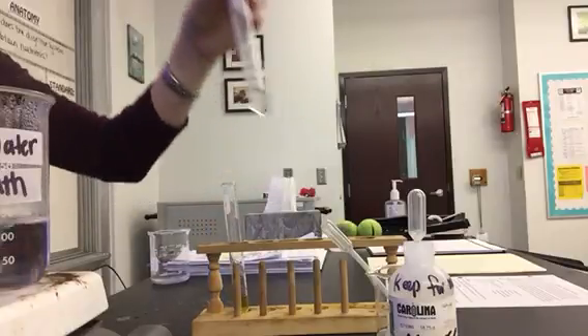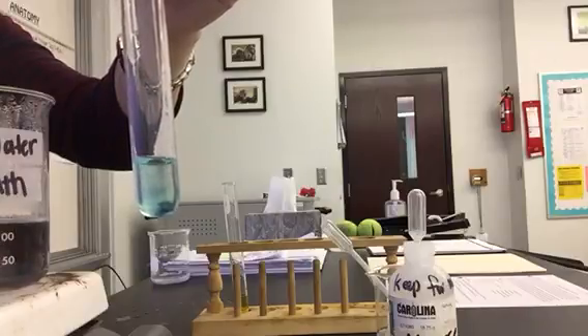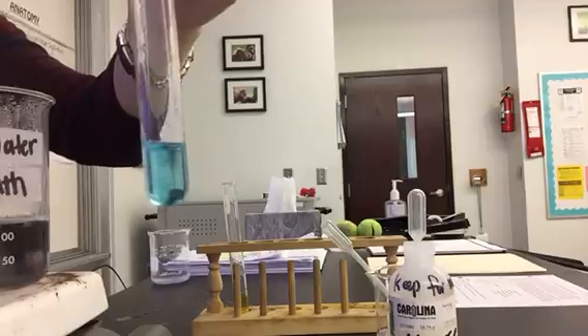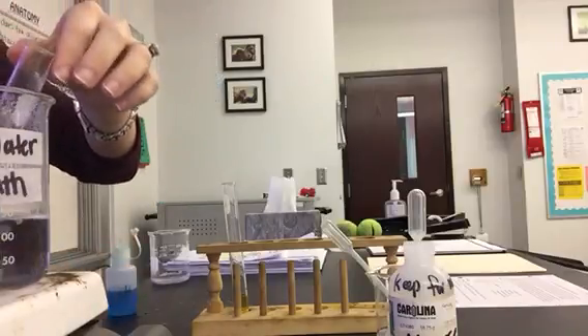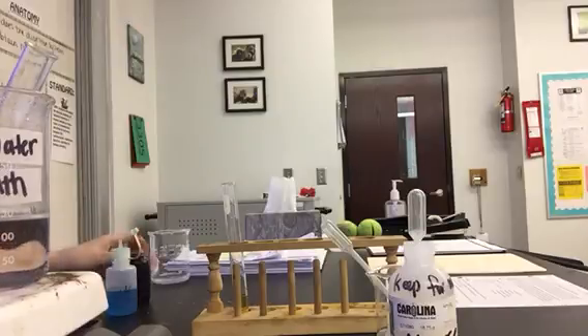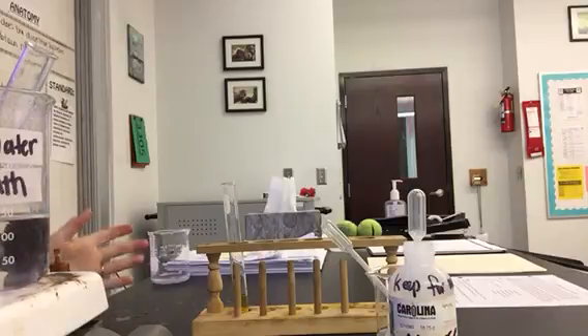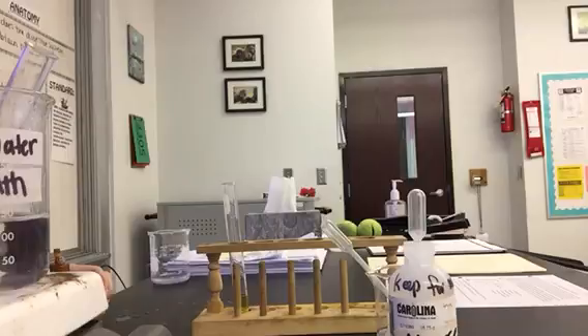For the next one, we're going to do 20 drops of Benedict's solution. It has to sit in a boiling water bath for a couple of minutes. If there is glucose present — which is a monosaccharide — Benedict's is an indicator for monosaccharides. If glucose is present, we'll see a color change: it could be green, it could be orange, or if there's a lot of sugar present, it could be red, or there could be no change at all. So we're just going to wait and see what happens.